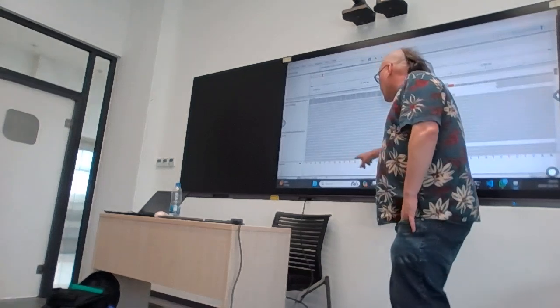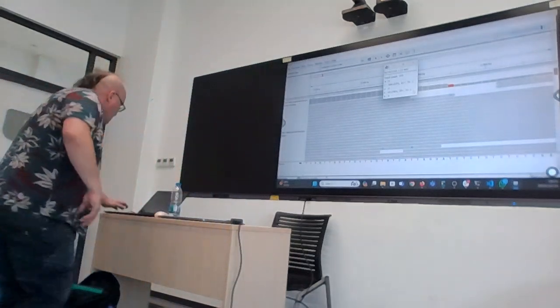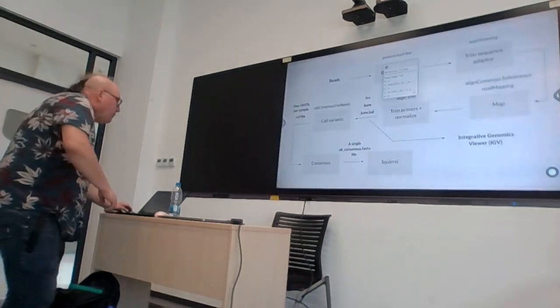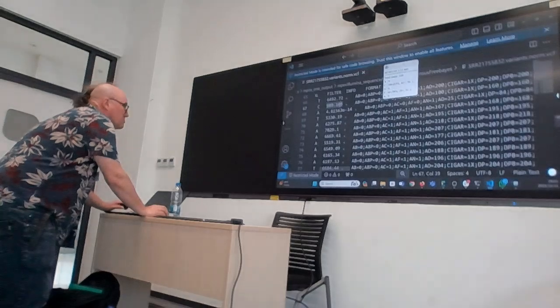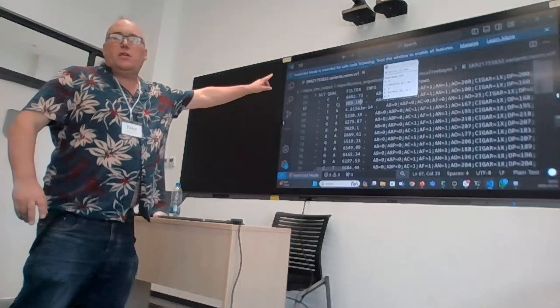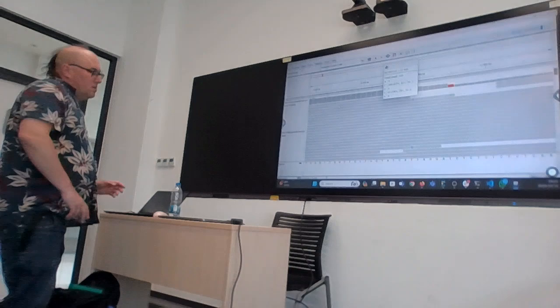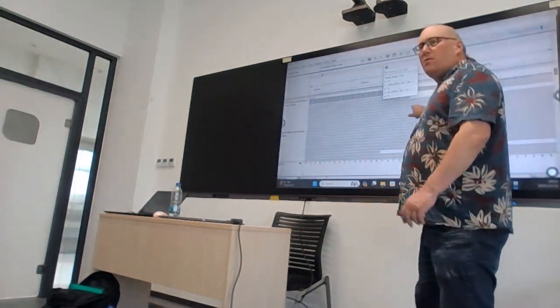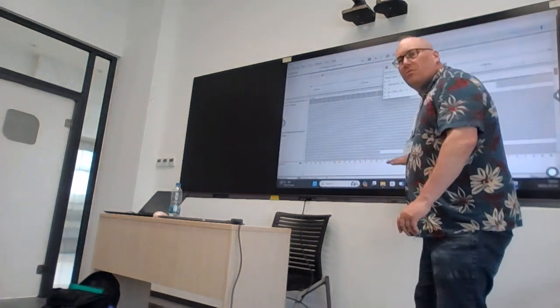The reference, this is the reference down here. If we go back to the VCF, oops, I just scroll sideways there. It's saying the mutation is from a T to a C. Okay? And here, where we see nothing, where it's just gray, that means that the read matches the reference.